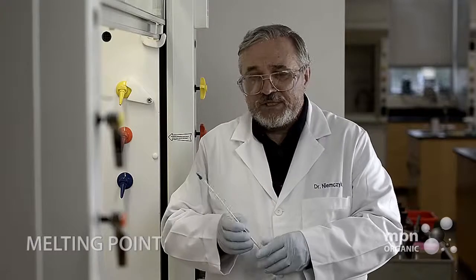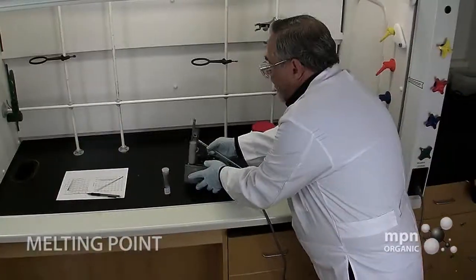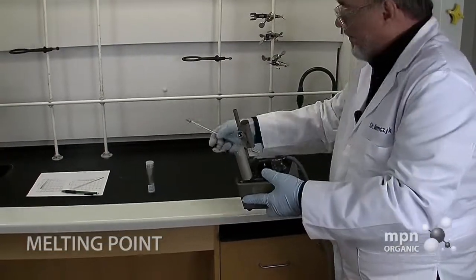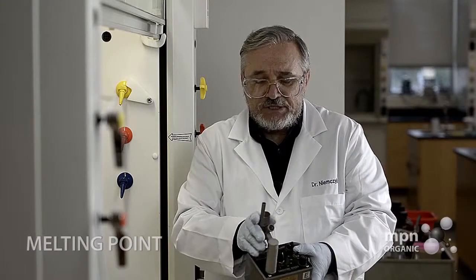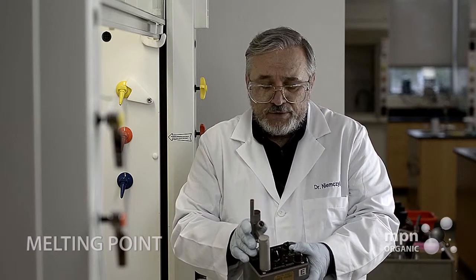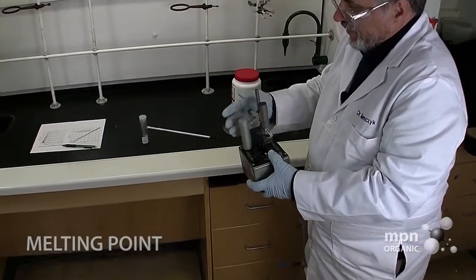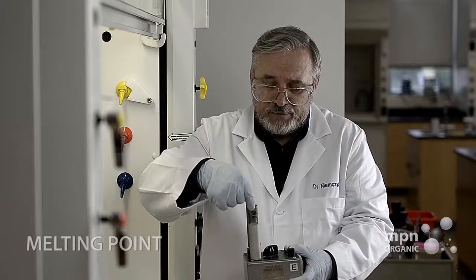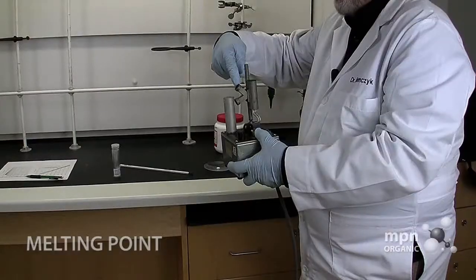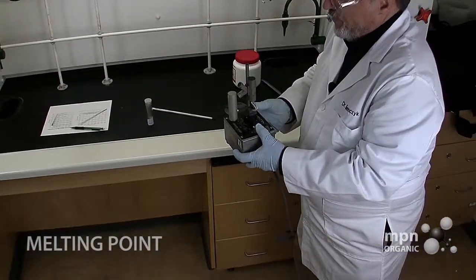The second thing we have to provide is a thermometer. These thermometers are going to fit in what we call the thermometer wells. The MeltTemp is a variac which heats this aluminum bar. We have a light that illuminates the sample chamber right over here, and we can look through a magnifying glass on top that magnifies the bottom of the melting point tube — and therein you can tell whether the sample is melting or not.